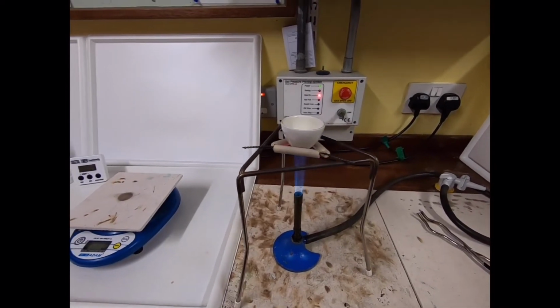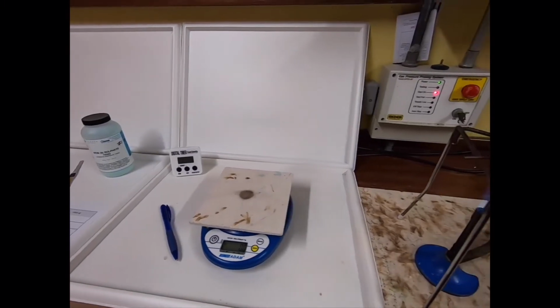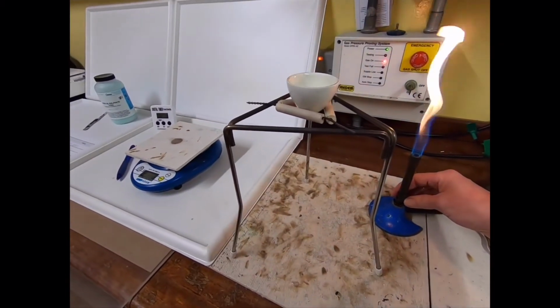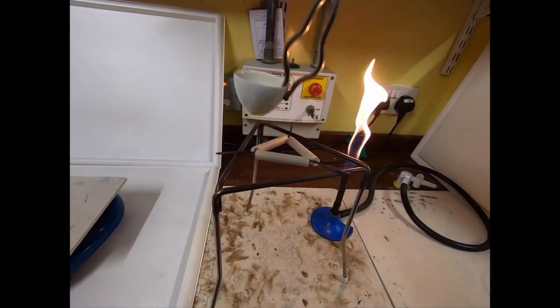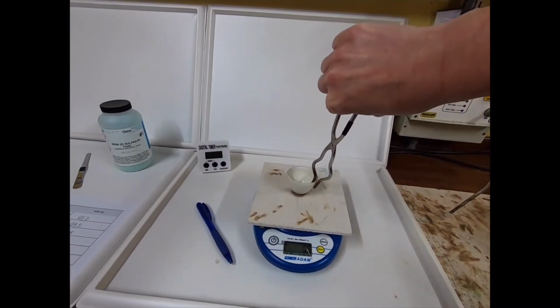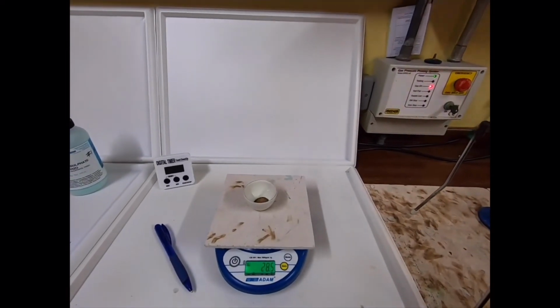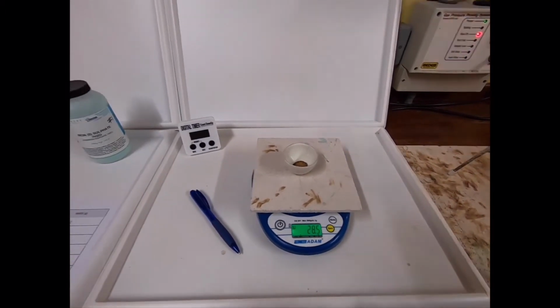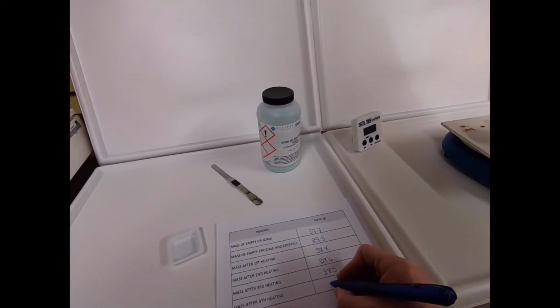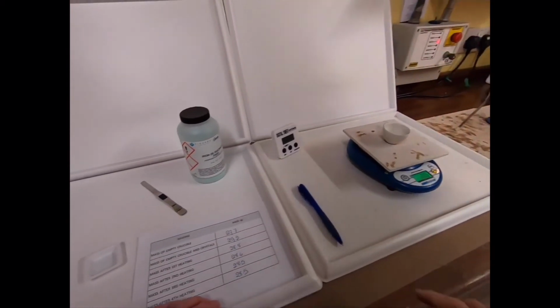You can see there's no gauze there, just the pipe clay triangle on the tripod, and when it's had that 2 minutes of heating, then we can measure the mass again. If you were doing this in a classroom, you would allow it to cool because you probably wouldn't have the scales right beside you. You wouldn't want to touch it. And you can see it stayed at 28.5. So that is our final measurement. And that gives us our set of results.